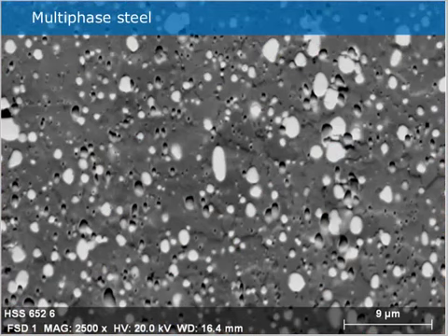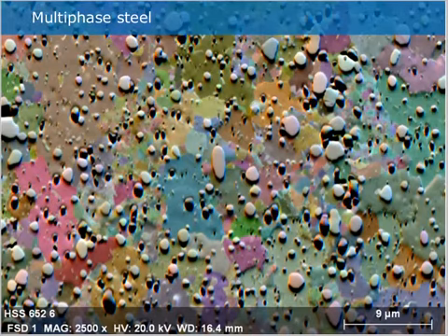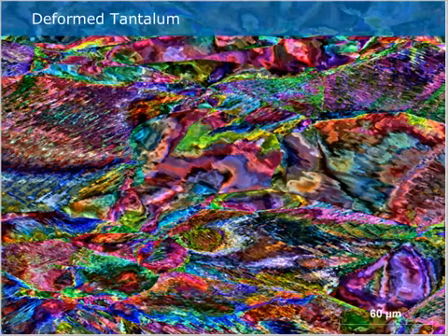If you want to combine it with a BSE detector, there's a multi-phase steel showing bright carbides, tungsten carbides, and also a few titanium carbides which show not that big contrast because they have less intensity. And if you combine it with the forward-scattered detector, that means with orientation determination, you see in the background now the matrix orientations. We have small grain areas and large grain areas which you can't see before. That means if you're really interested in small grain areas like here, you can then specify or define this area simply for a better interpretation of your material.